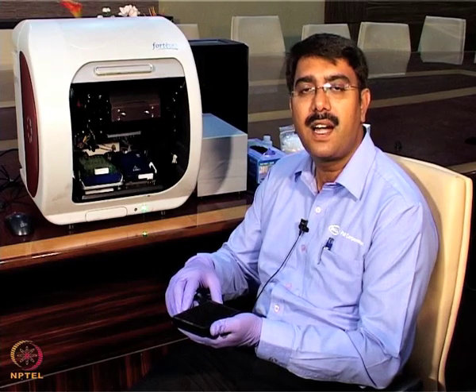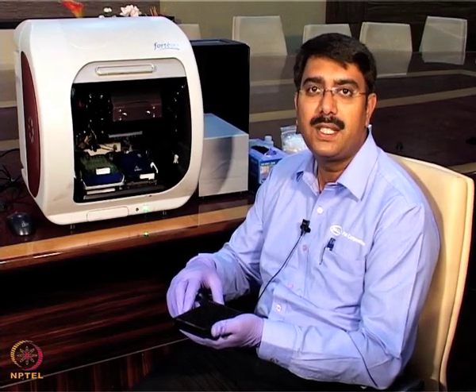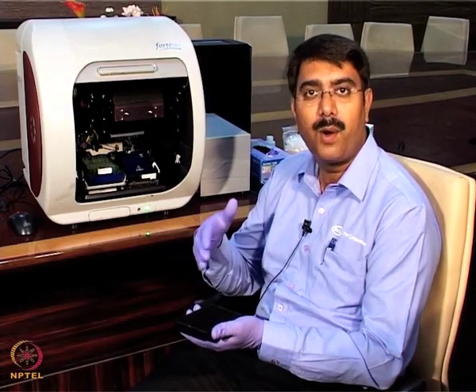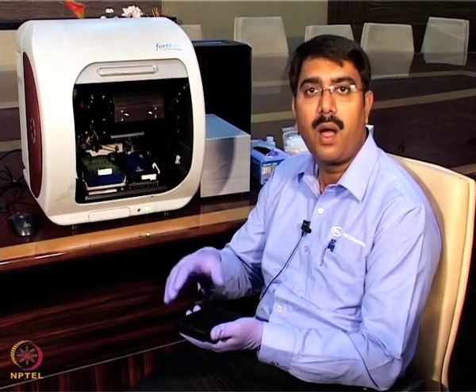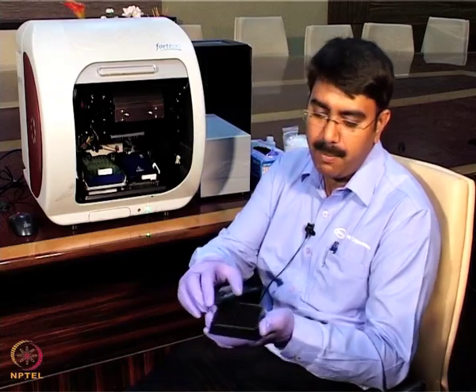Here I am taking the starting concentration at 25 micrograms per ml. I am going to do a serial dilution with a 2-fold from 25 to 12.5, then serially I go for a 2-fold concentration across 6 data points. This is the plate map here.